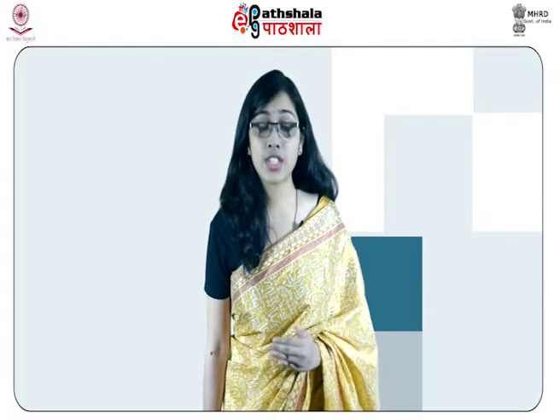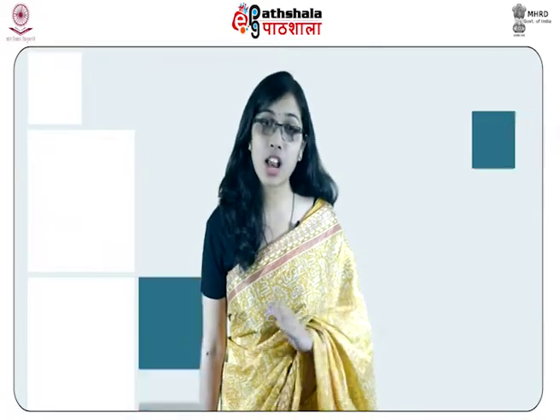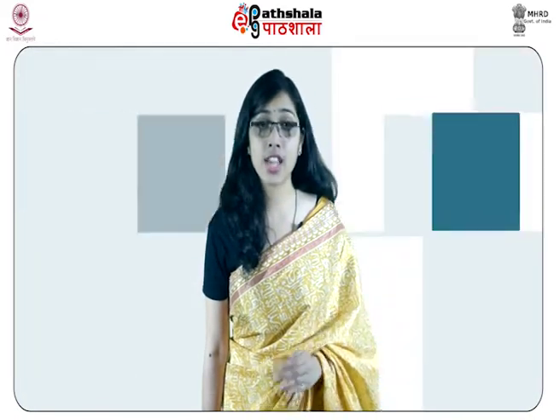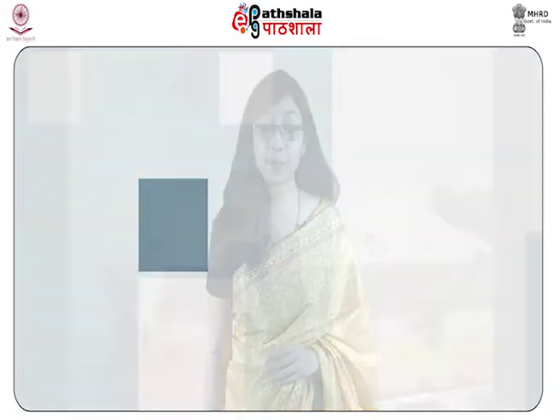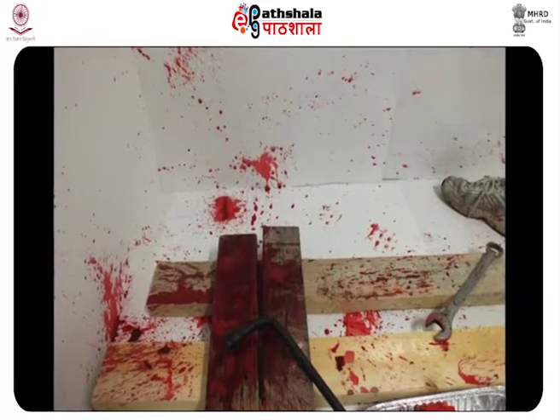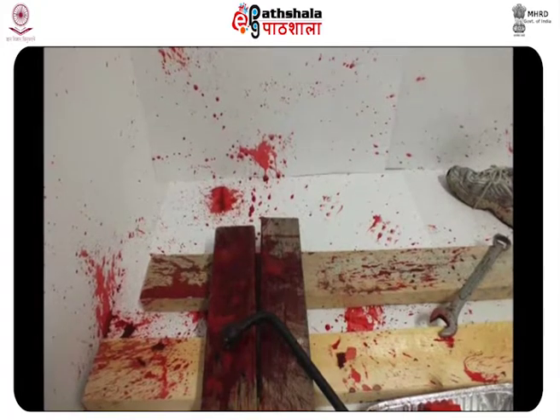If a stain is on the non-absorbent surface, it is allowed to dry and the article is collected. If the stain contains sufficient liquid blood, it is collected in the same way as the liquid blood. If the stain is on the absorbent surface and has penetrated the surface, it is allowed to dry and the article is collected.